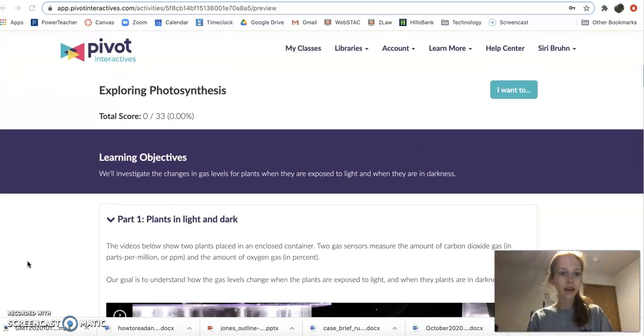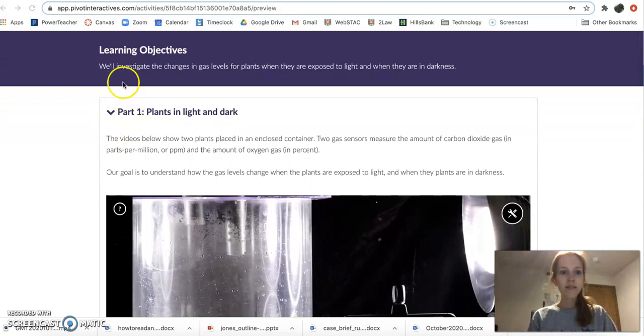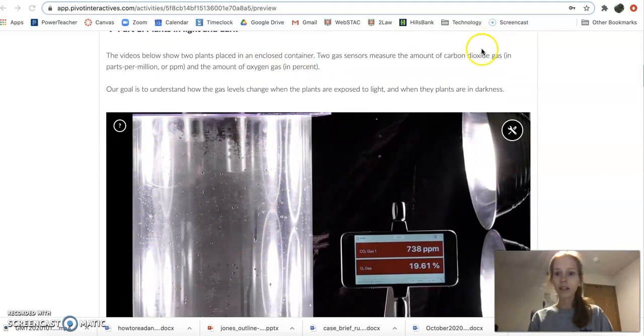We're up here in Pivot. Hopefully you're here too. And we're working on this Exploring Photosynthesis Part 1 lab. So this lab tells us we're going to investigate the changes in gas levels. We're talking about oxygen gas and carbon dioxide gas for plants when they are exposed to light and when they are in the darkness. So Part 1 has this nice video. It says that we've got these plants in a closed container. That's this thing. And there are gas sensors that are going to measure carbon dioxide gas in parts per million.